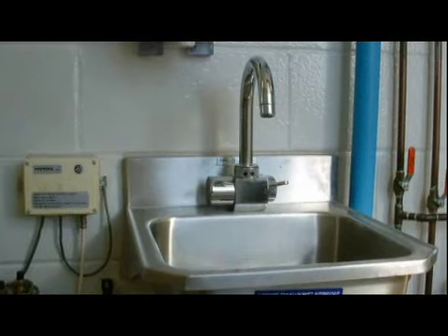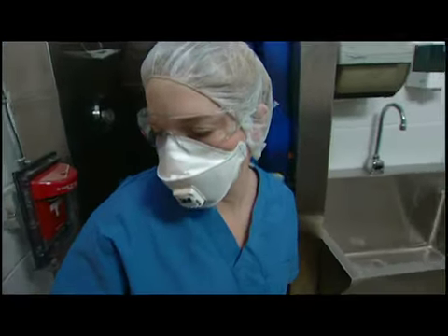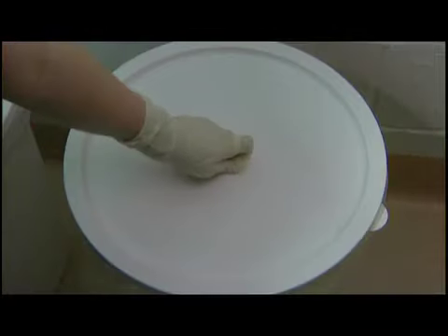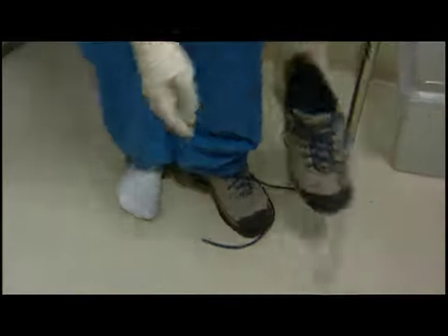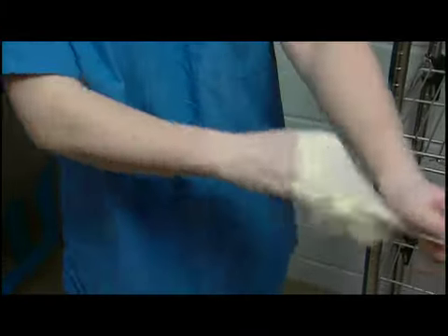Wash your gloved hands. Cross into the dirty change room. Remove your boot covers, head cover, respirator, and safety glasses. If you were wearing your personal eyeglasses, decontaminate them before crossing over to the clean side. If you are wearing dedicated shoes, remove and store them. Remove gloves and discard them.